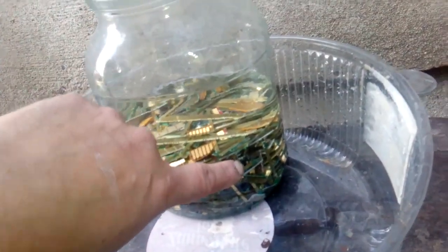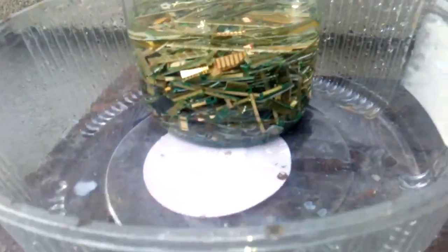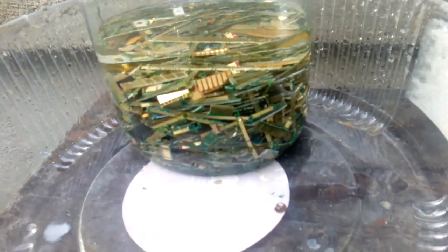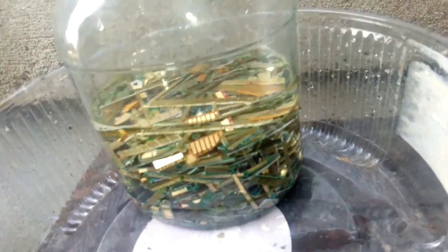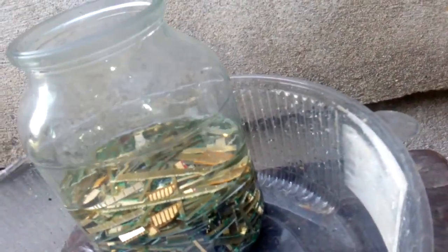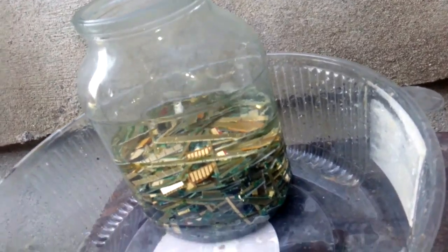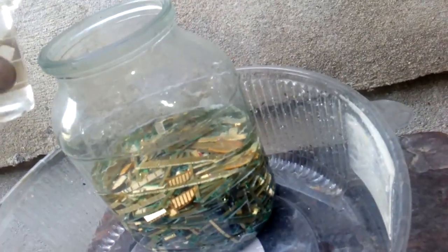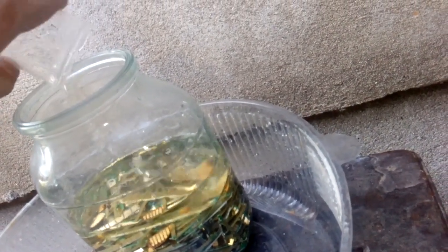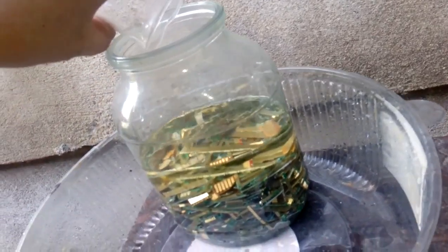Here I have about half a kilogram of gold fingers — different fingers from slot cards, RAM sticks, and other stuff. I have one liter of HCl and 100 milliliters of nitric acid to make some aqua regia.